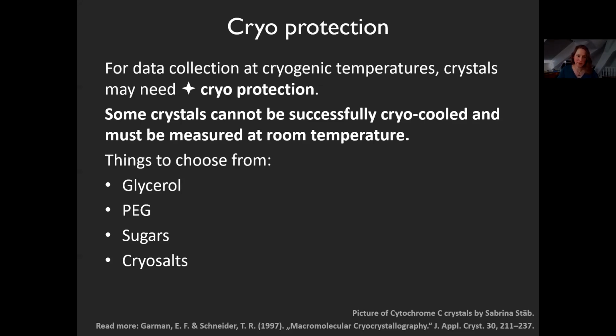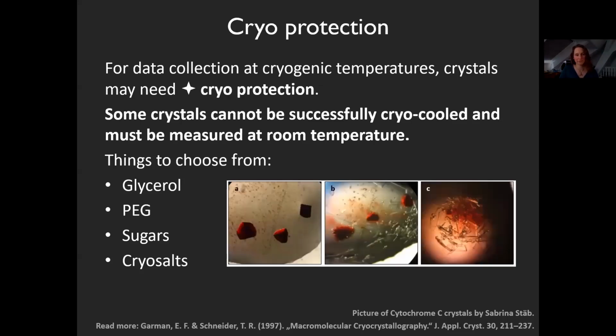I had some good experiences with glycosylated proteins with sugars. There are also salts. And I'm not listing this here because it's a little bit exotic, but you can also dump your crystals in oil.